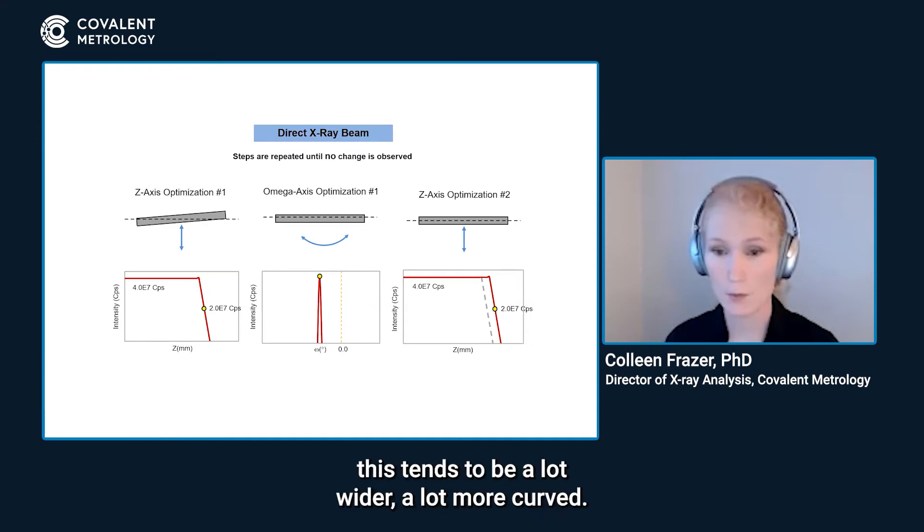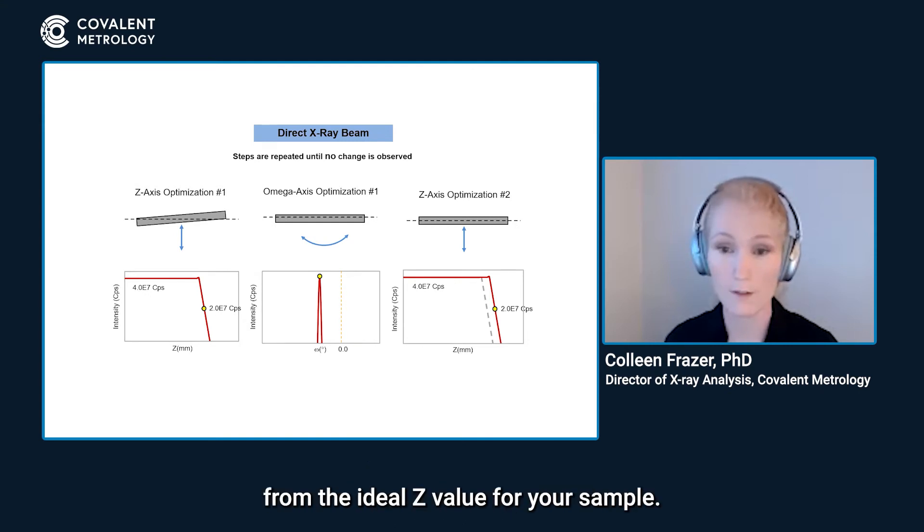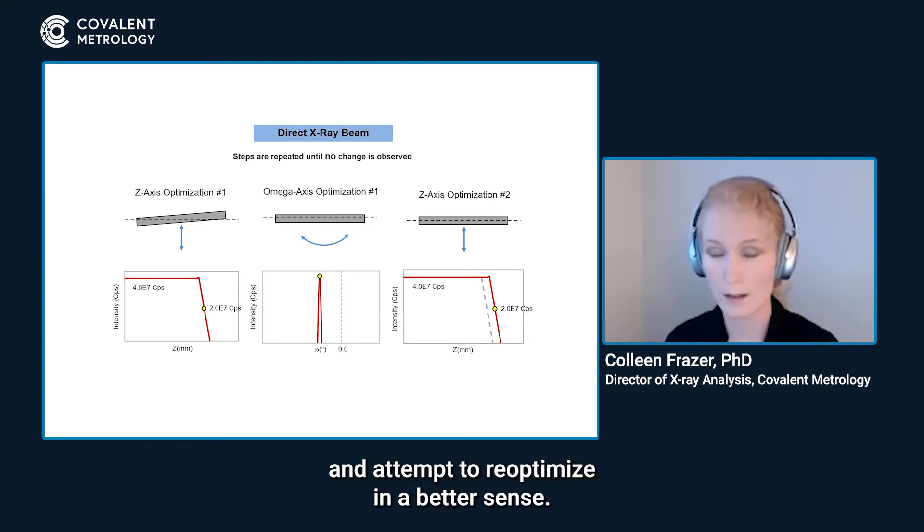If you have a lot of curvature in your sample, this tends to be a lot wider, a lot more curved. If this particular plot is sort of truncated at the top like a MESA, then it's likely that you're starting at a Z value that's significantly far off from the ideal Z value for your sample. If you continue to iterate the steps, you will achieve the right Z or you could go back and attempt to re-optimize in a better sense.